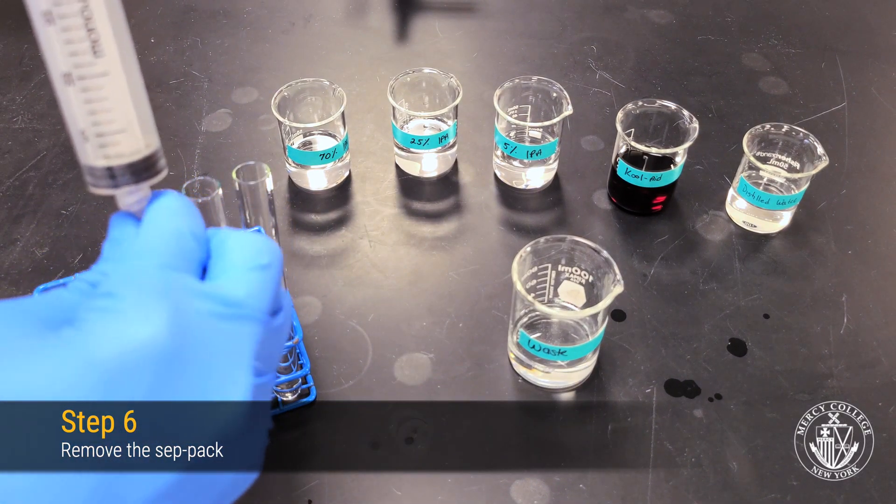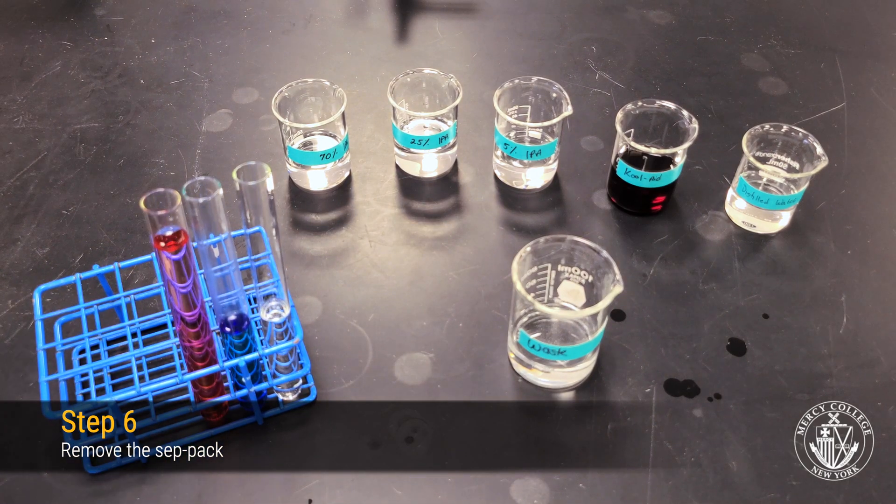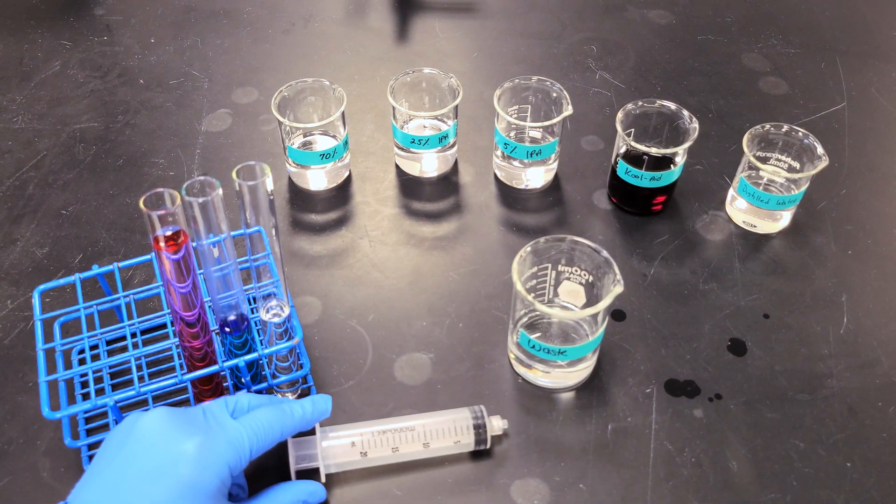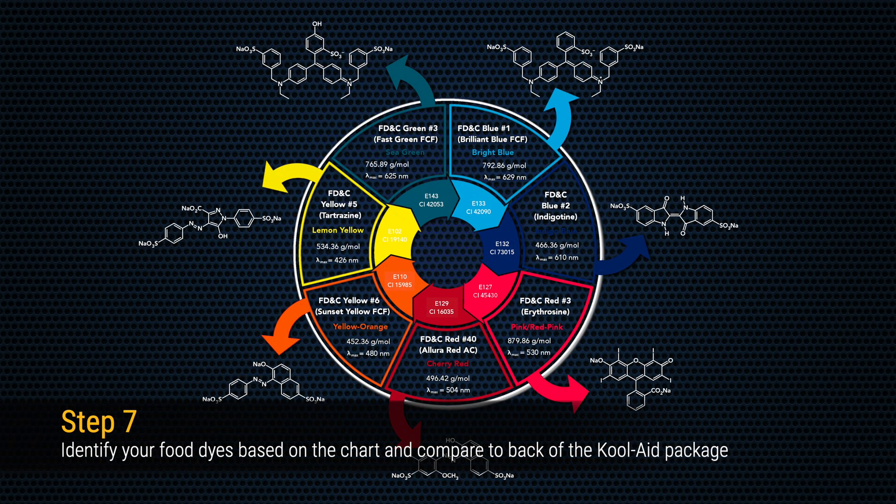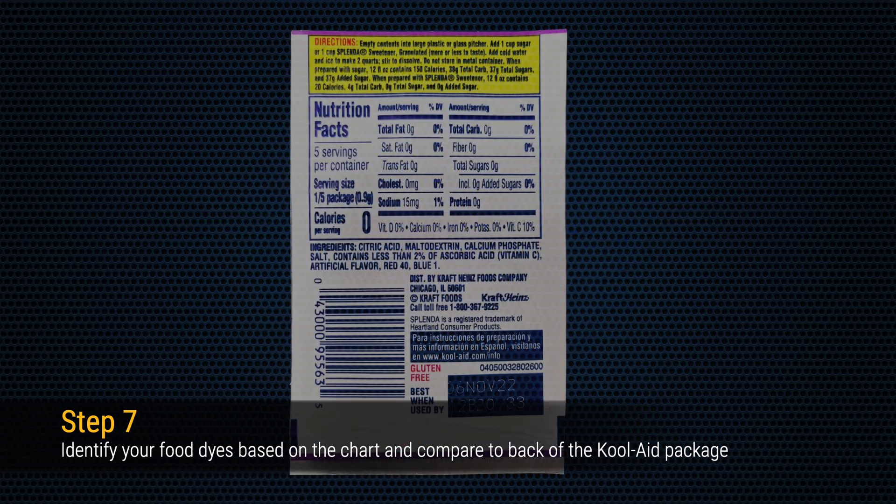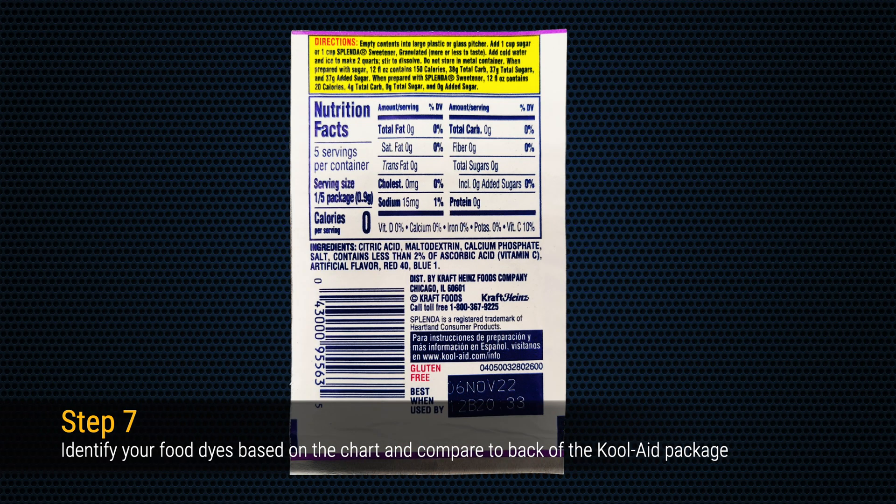Now remove the CEPPAC cartridge from your syringe and place all of your solutions into the provided waste container. A successful column chromatography experiment should yield two distinct colors. To identify the dyes present, compare to your food dyes chart and compare to the ingredients list on the back of the Kool-Aid packet.